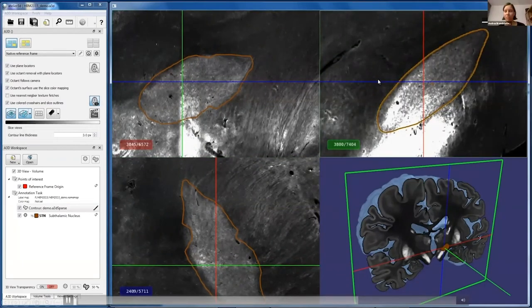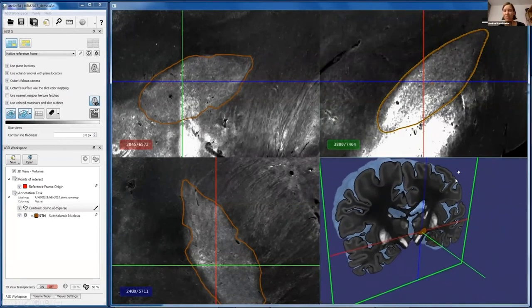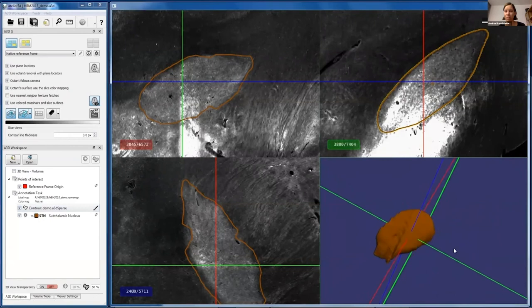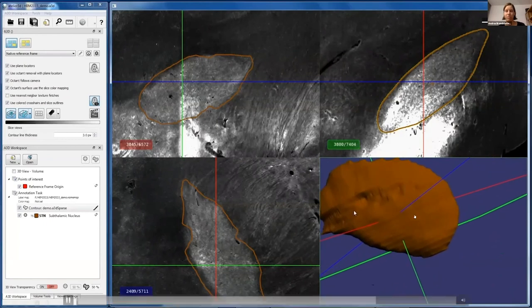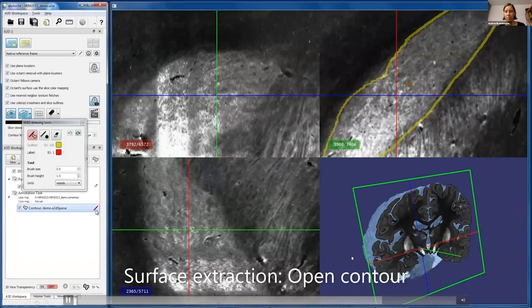I have just a short comment on the annotation. It is absolutely important that there are no holes within your annotation. As soon as there is any hole, the whole process cannot be done. But you will be informed anyway during the process, and you can click on the coordinates to see where the hole is and whether you need to make any corrections.